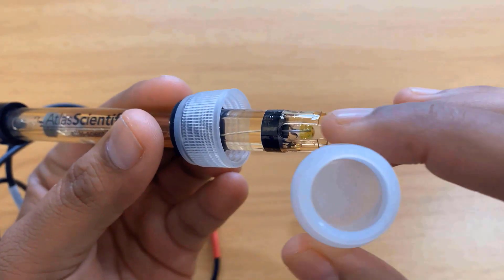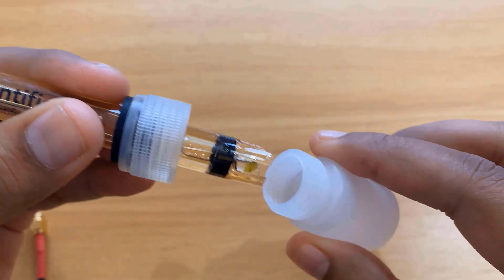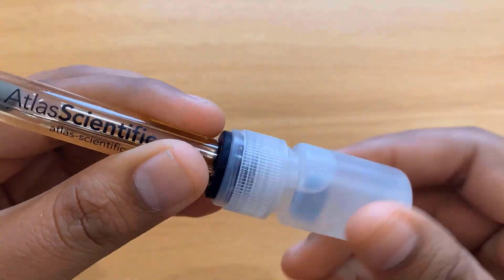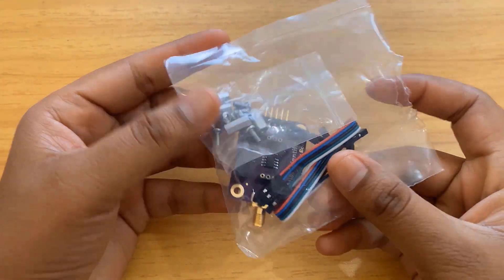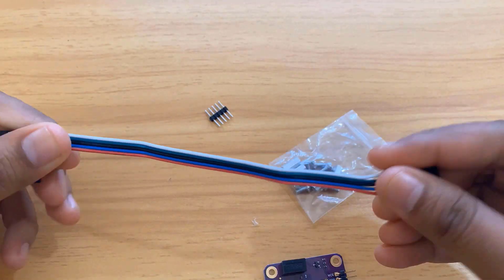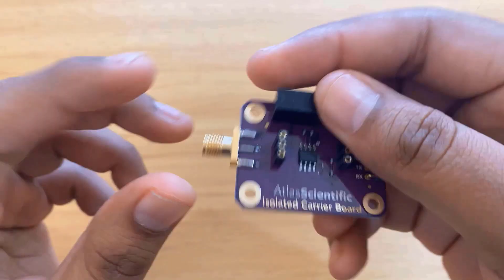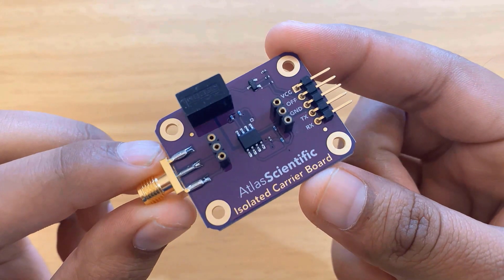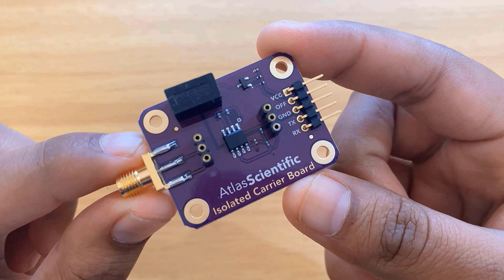When the sensor is not in use, dip it in buffer solution. Do not keep the tip exposed to air — the storage bottle is used to prevent the bulb from drying out. This is another packet that contains the signal connector board along with some screws, nuts, and jumper wires. This is an isolated carrier board for signal conversion and noise filtering. At the center of the board there is an integrated circuit.